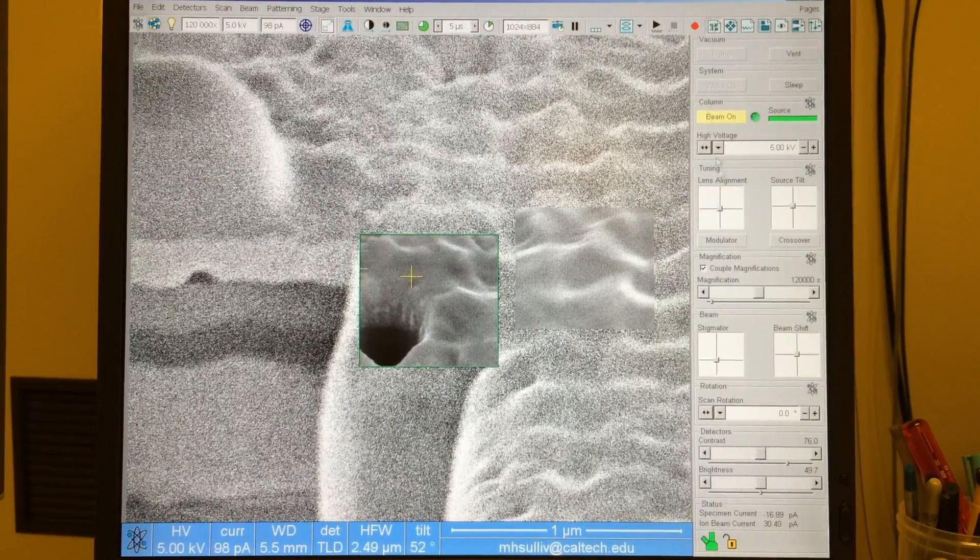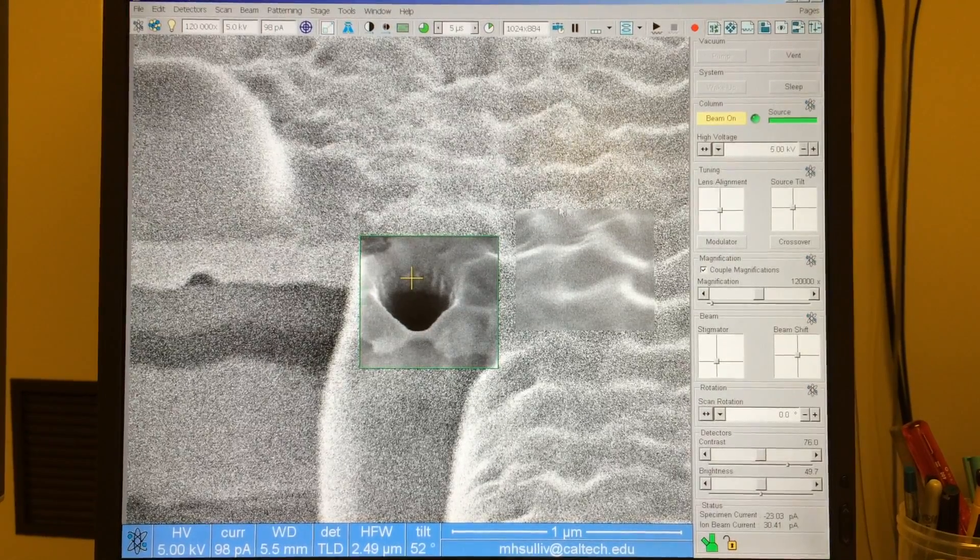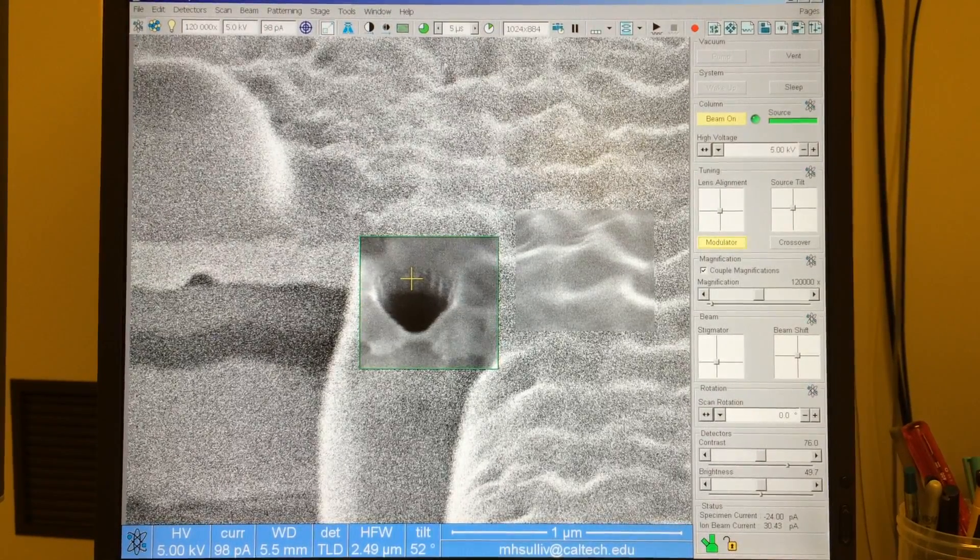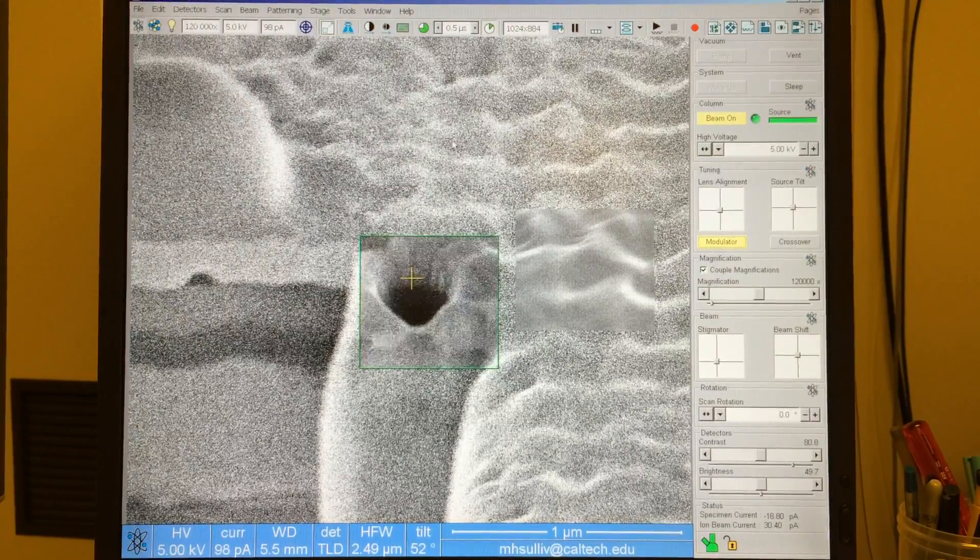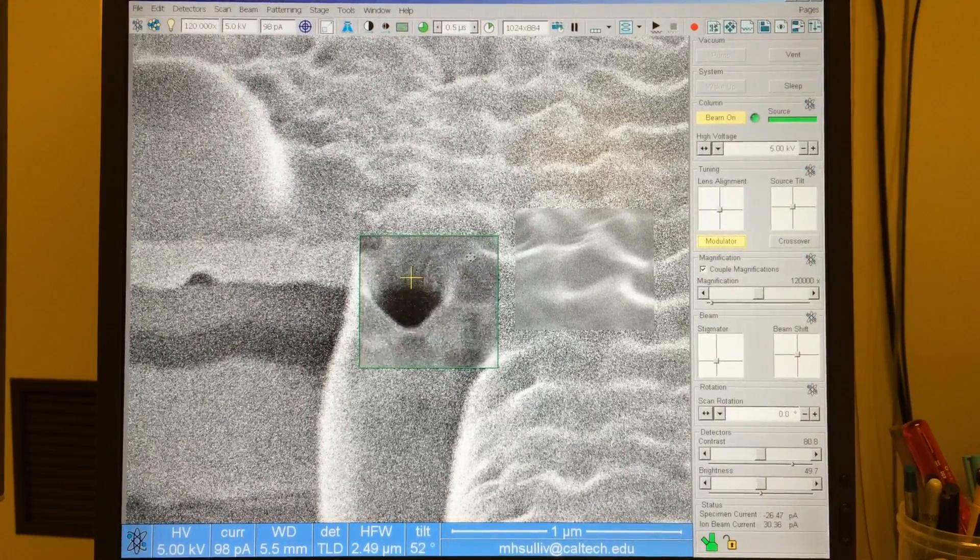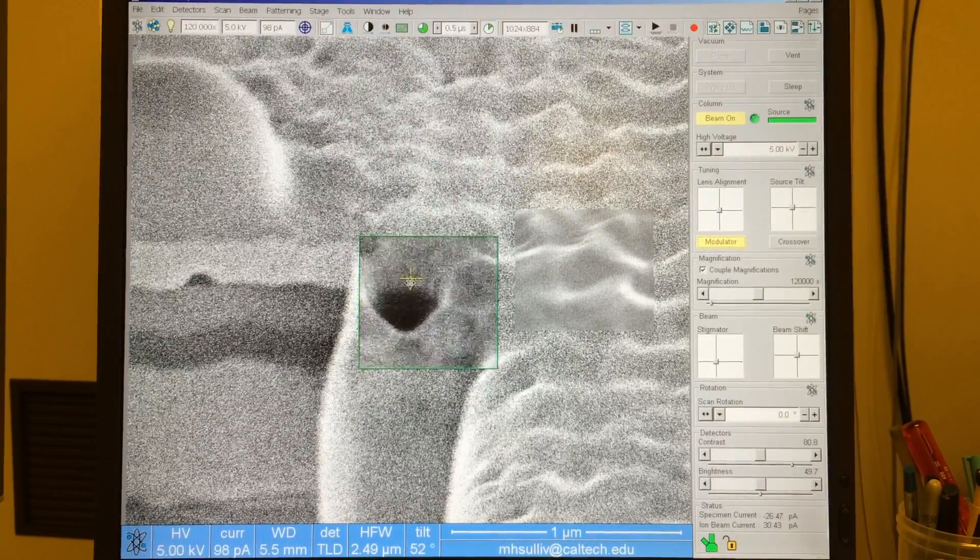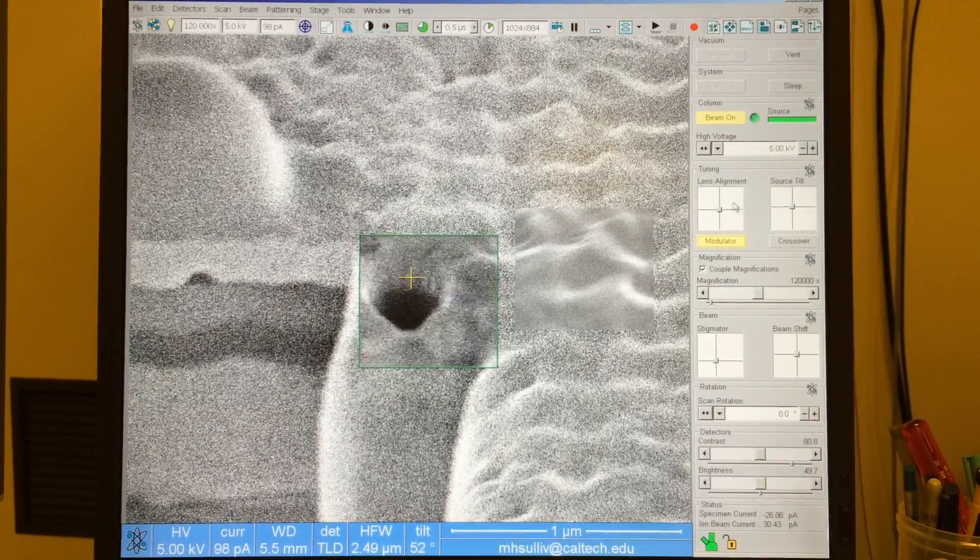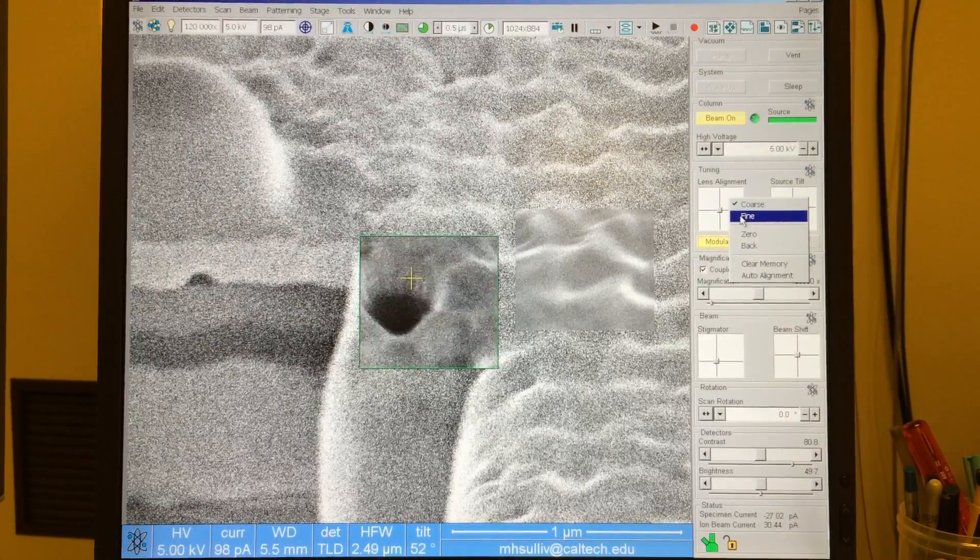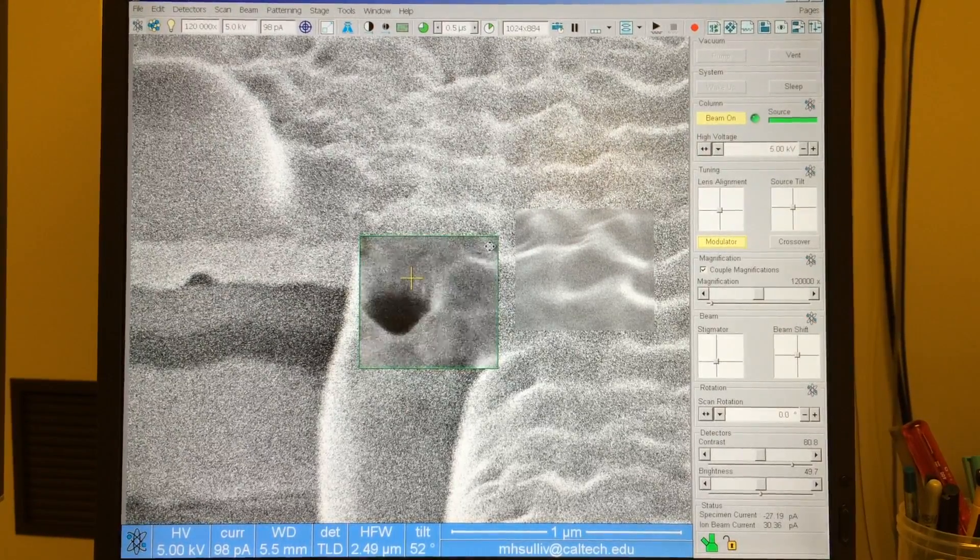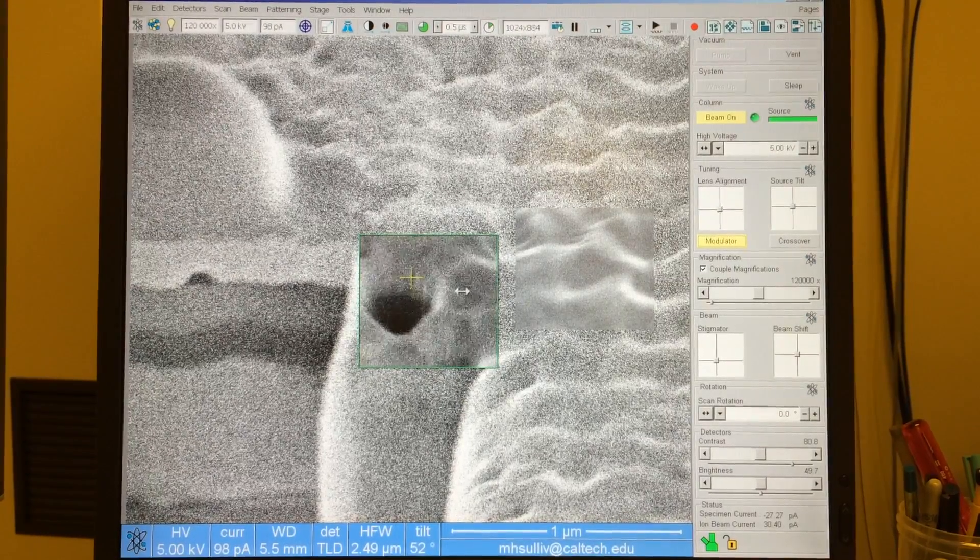So from the beam control page, I am going to turn on modulator and change the dwell time to something that's much smaller so that I get a faster refresh rate. Now you can see my image is moving side to side here. I want to correct that using this lens alignment. I'm going to right-click in here and select Fine. That will allow me to more finely control this lens alignment.